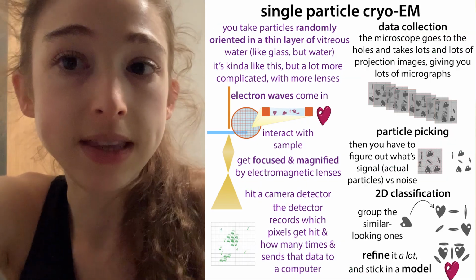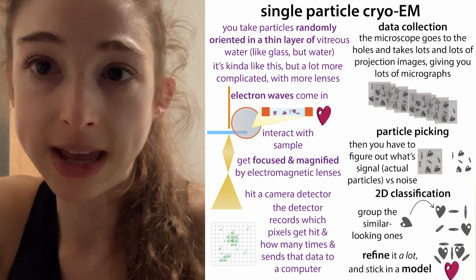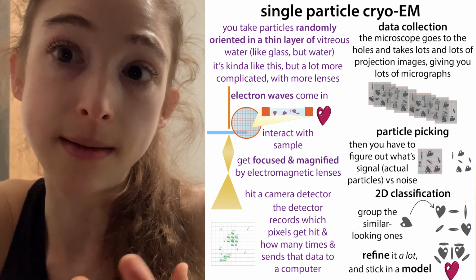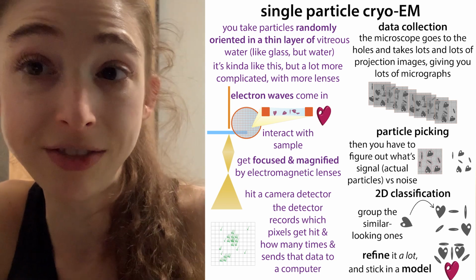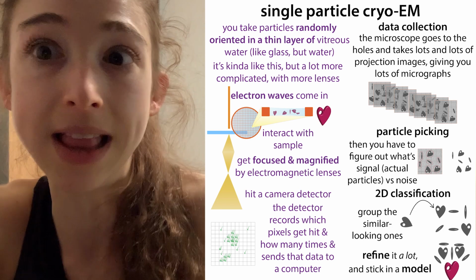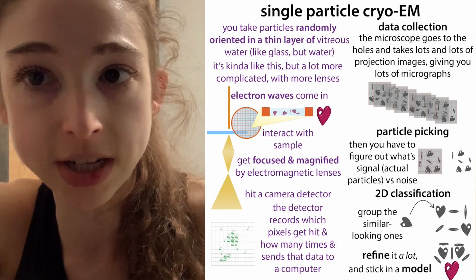And with these techniques, there's recently been a big upsurge in Cryo EM. This was because of some technical innovations, first the cryo part, being able to do this really cold, so you're able to protect these samples because you're going to be shooting electrons at them, which are really energetic, and so this can be really damaging to them.